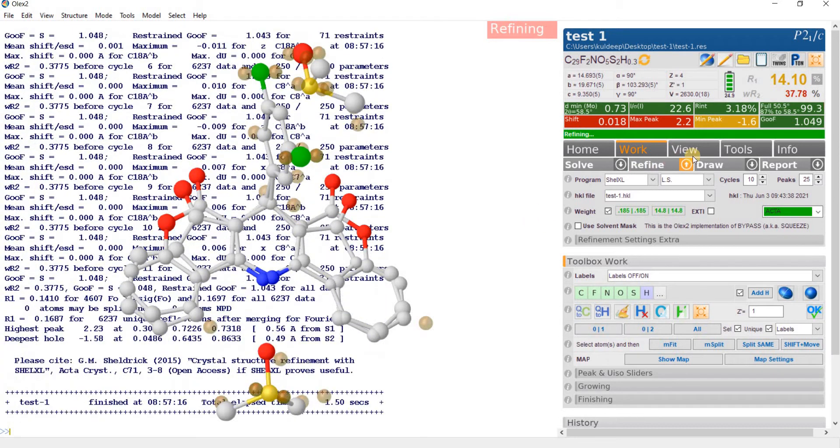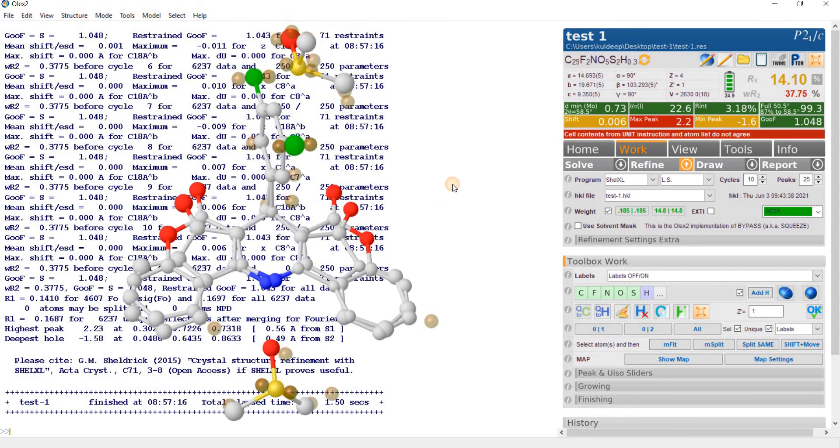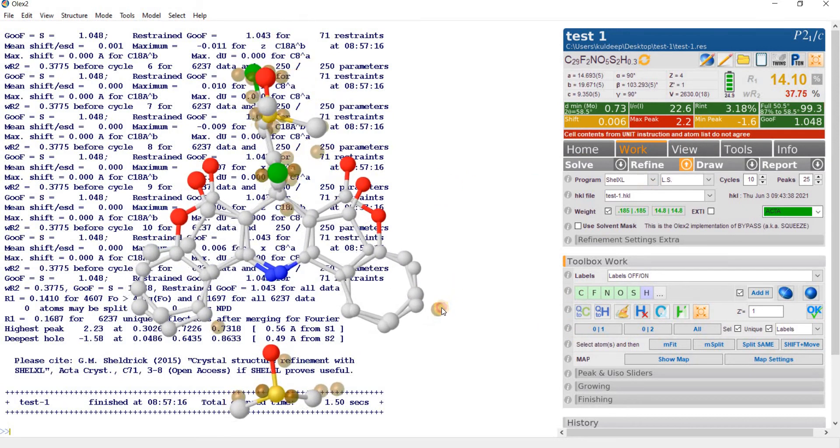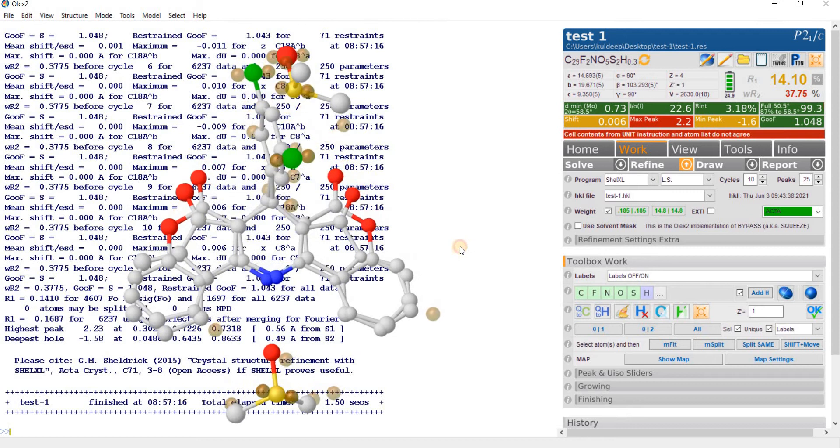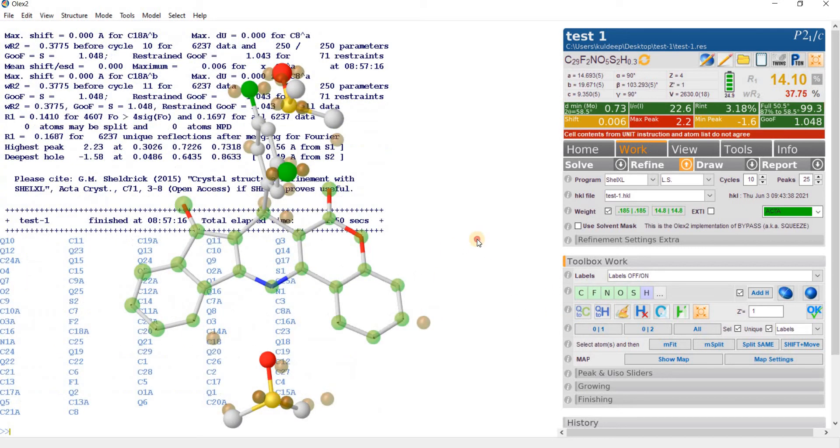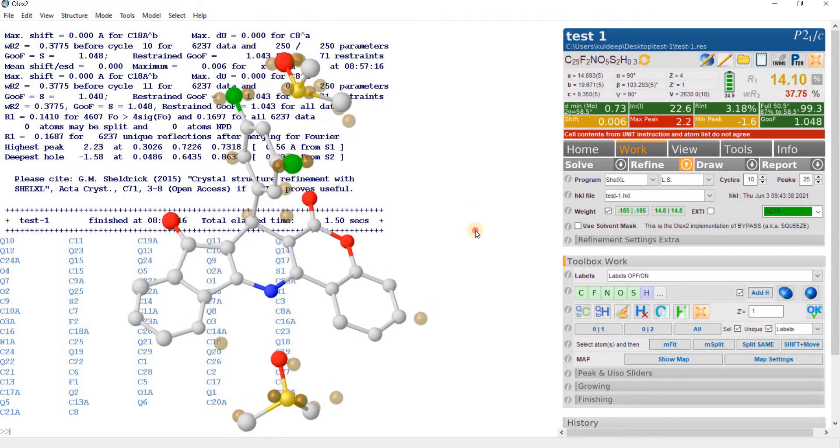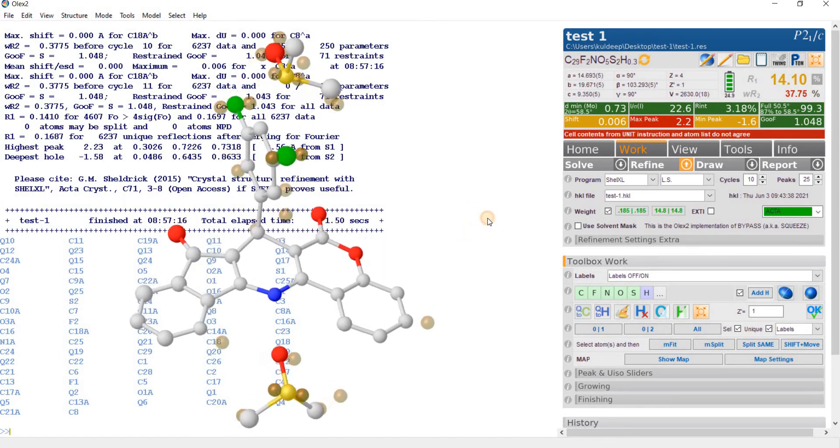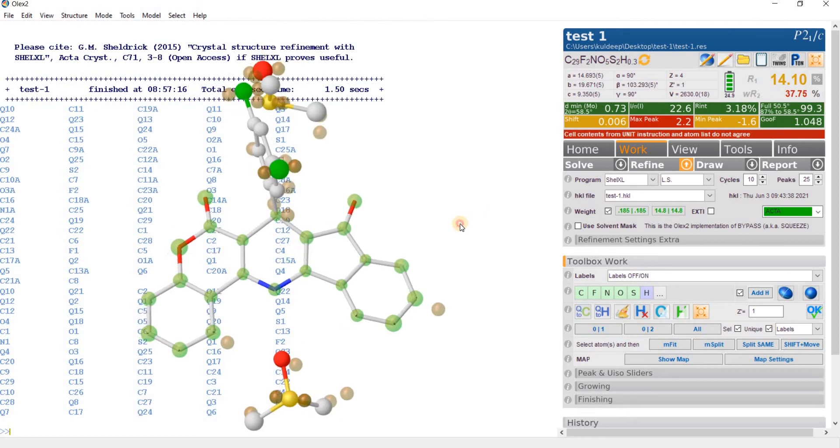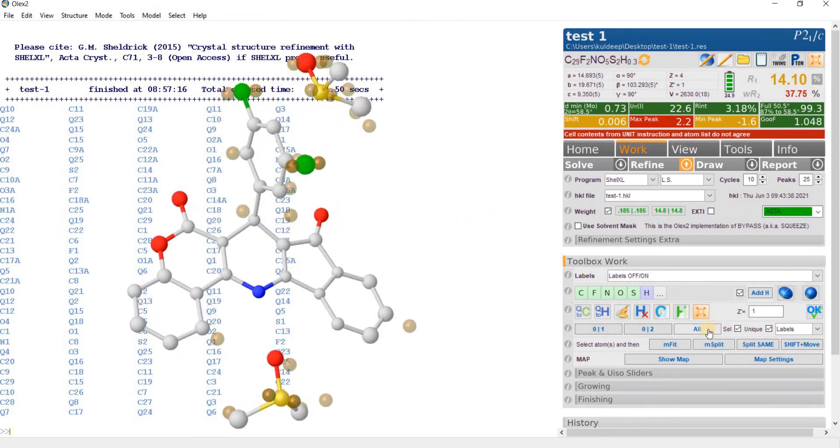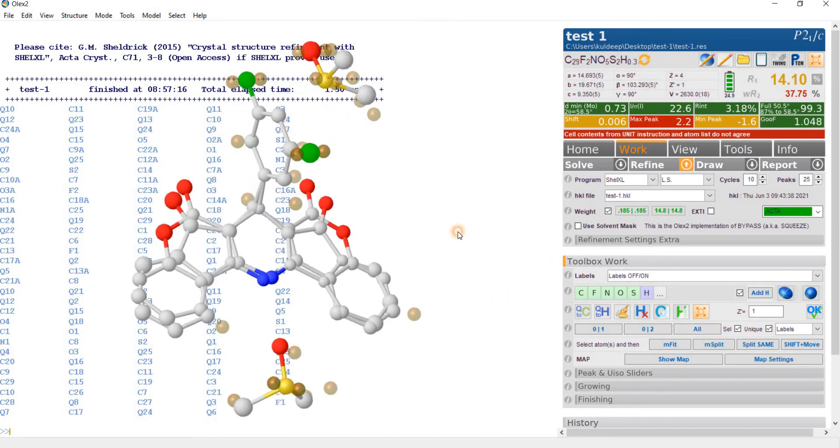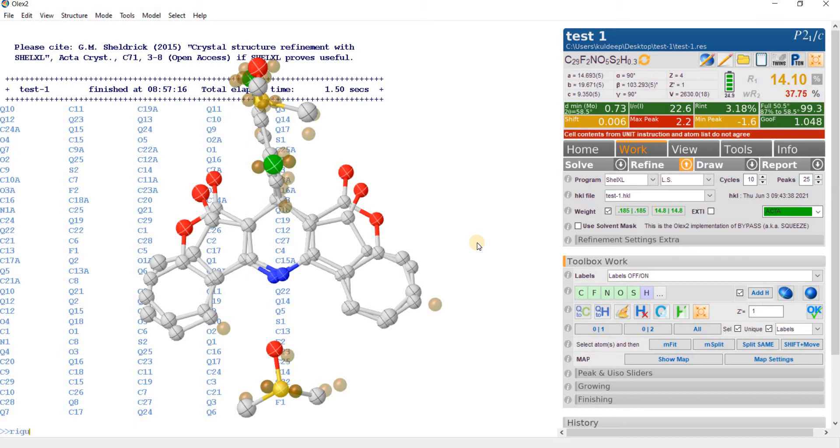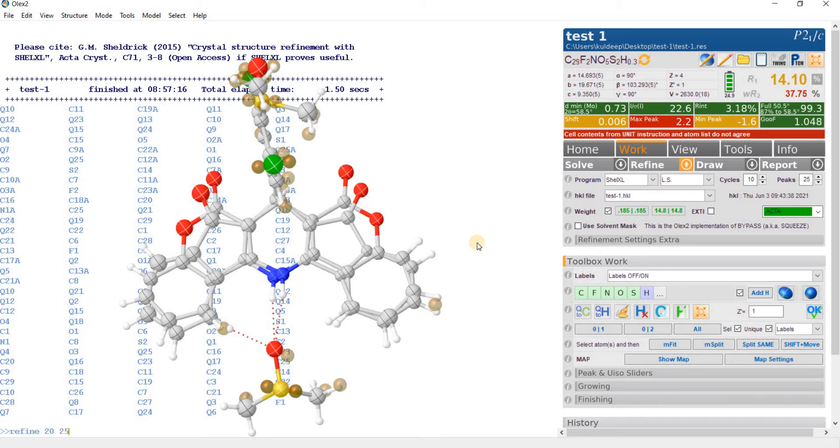You can also increase the refinement cycle so that the refinement is converted. Now you can see the two part individually, part one, this is part one quite looking good and this is part two also looking good.